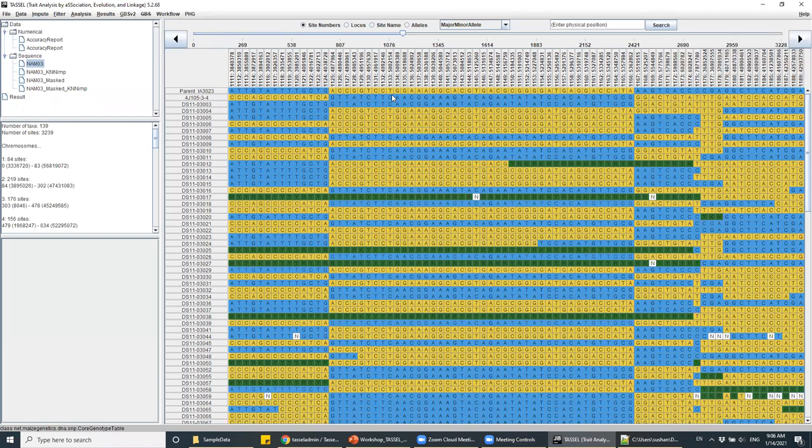Thanks. Looks like there's another question in the chat. Yeah, I saw the question from Nicole. We're supposed to get the same numbers that you did. I think as long as the numbers are similar, it's reasonable. It doesn't have to be exactly the same. The two times I ran it, it was off by a little bit too. So during the imputation process, the results might vary a little bit each run.